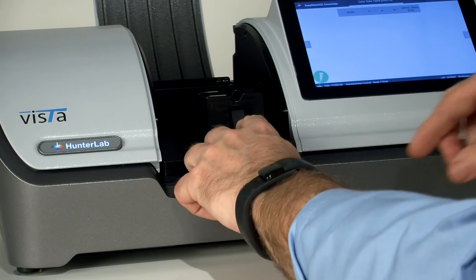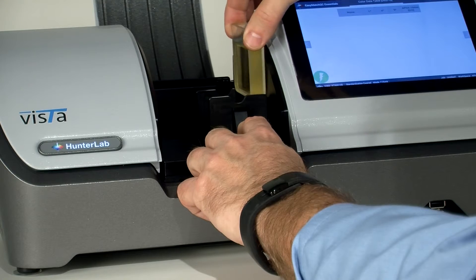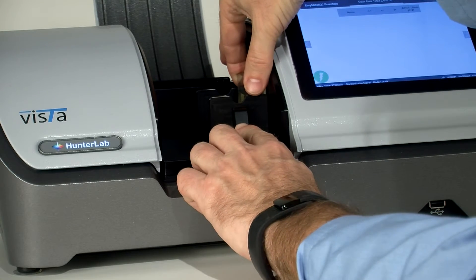Pull back slightly on the lever and then insert your sample. Ensure the sample is firmly against the wall.